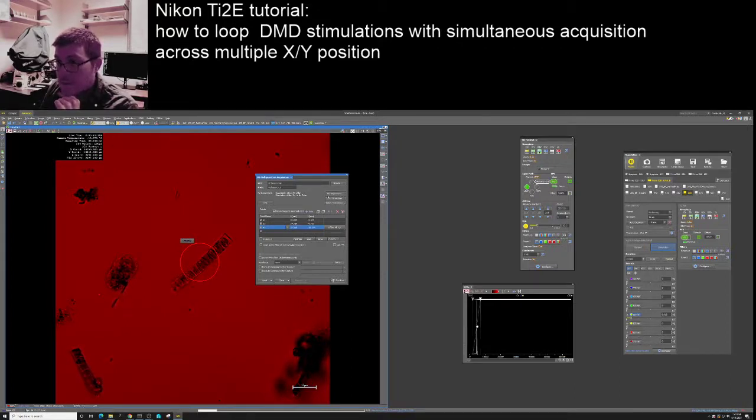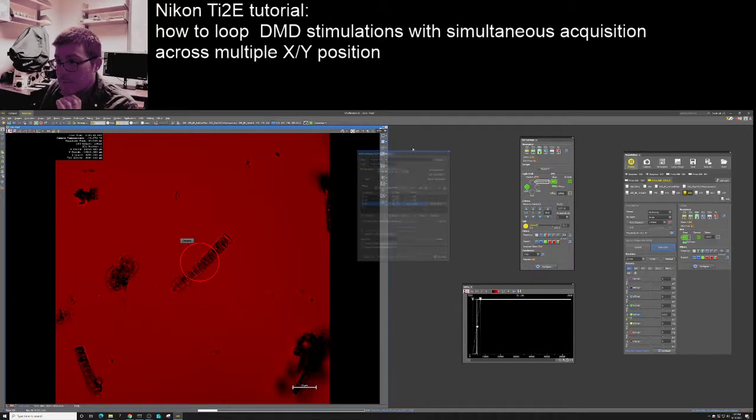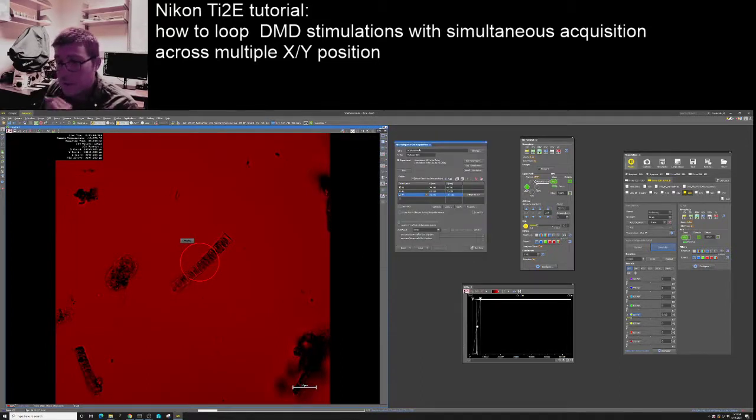So maybe you want to do a standard ND acquisition. I actually don't know why you would do that compared to just using the ND acquisition, but it's here. But what's also very useful is it has stimulation protocols that you can run here, either sequential stimulation or simultaneous stimulation. And so, for example, Nitesh learned how to use the simultaneous stimulation setting.